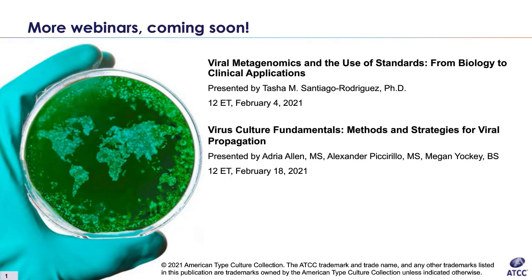I did see the comment above about the vial exploding and almost hitting this attendant in their eye. So that's not necessarily the vial expiring. What most likely happened there was that the vial was submerged inside the liquid nitrogen, at which point liquid nitrogen can seep into the vial through any cracks if it wasn't tightly closed.